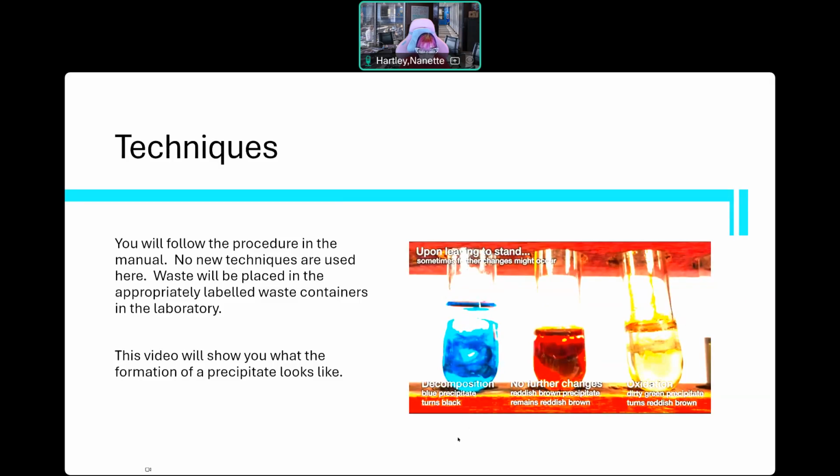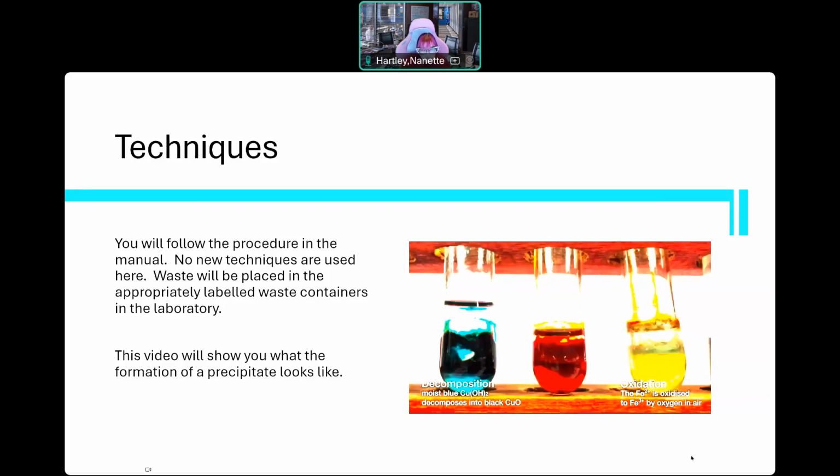Now, if you leave these sitting for long enough, they do change color. They do some other things. The copper hydroxide does begin to decompose. This one doesn't change at all, and this one starts to change color because it oxidizes. You have some things that happen to it over time. So I just want you to be aware that those things do happen over time, so it doesn't always look exactly the same as time goes on.